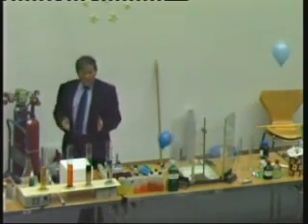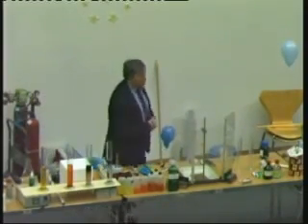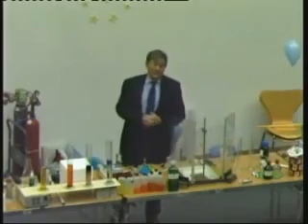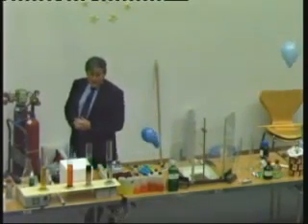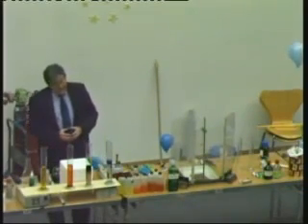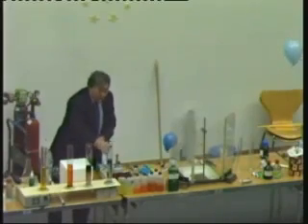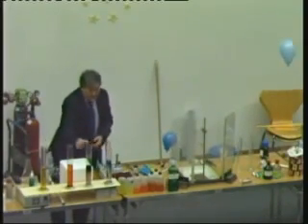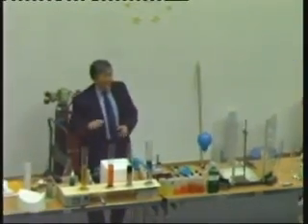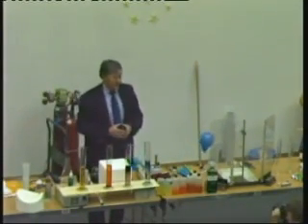And I'm going to do it in a fairly unusual form, but it's a very, very appropriate way of doing it, given that the United Nations Climate Change Conference is still on, and I know that because my daughter's there as a delegate. And so what I'm going to do is I've got some different indicators here, and this is a mildly alkaline solution, right? And so they're the appropriate colors for alkali.